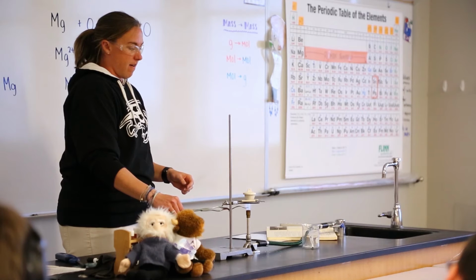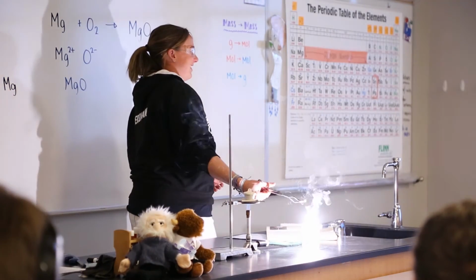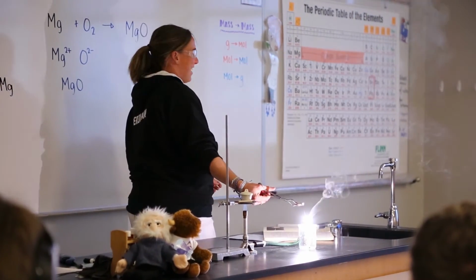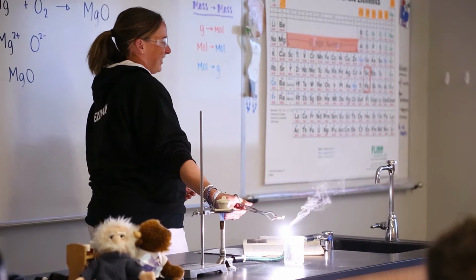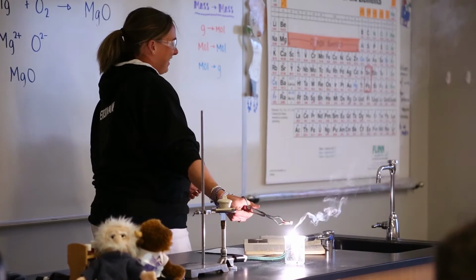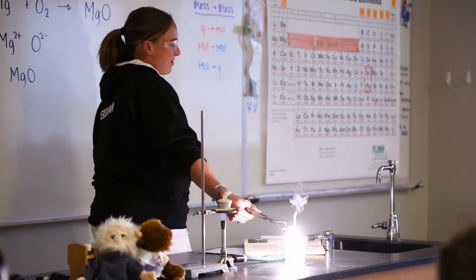So we're going to light it on fire here. Just look at it. Don't look at it. Oh my God! Don't look at it. I looked at it. I can see a bright light. You're going to get black spots later. Really? Yeah. We're going to go blind now.